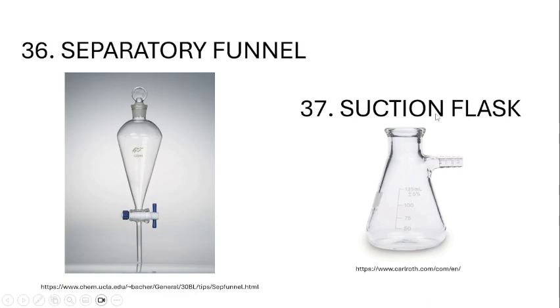Next is your suction flask. This is basically an Erlenmeyer flask with a sidearm, and others call it the Buchner flask, and it has a pair. Usually there's what you call the Buchner or the suction funnel. The suction flask is basically again an Erlenmeyer, and this sidearm is connected with rubber tubing, usually with a pump or a vacuum.